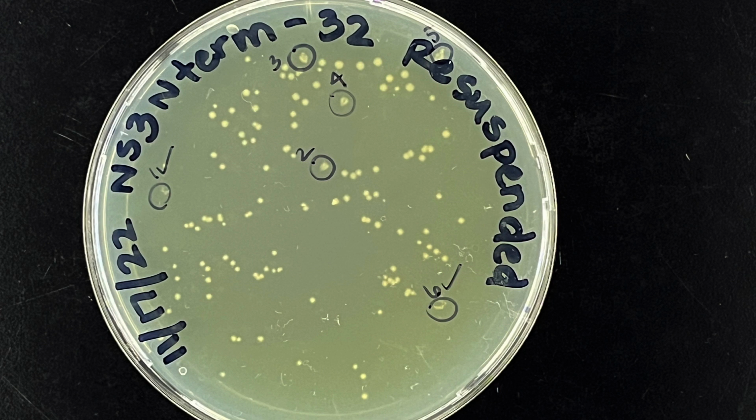It's an optional thing. It's a really good practice to do, but certainly not something that we do all the time. And there you have it. That's transformation. We'll show you how to screen for clones and determine whether we have the correct clones very soon.